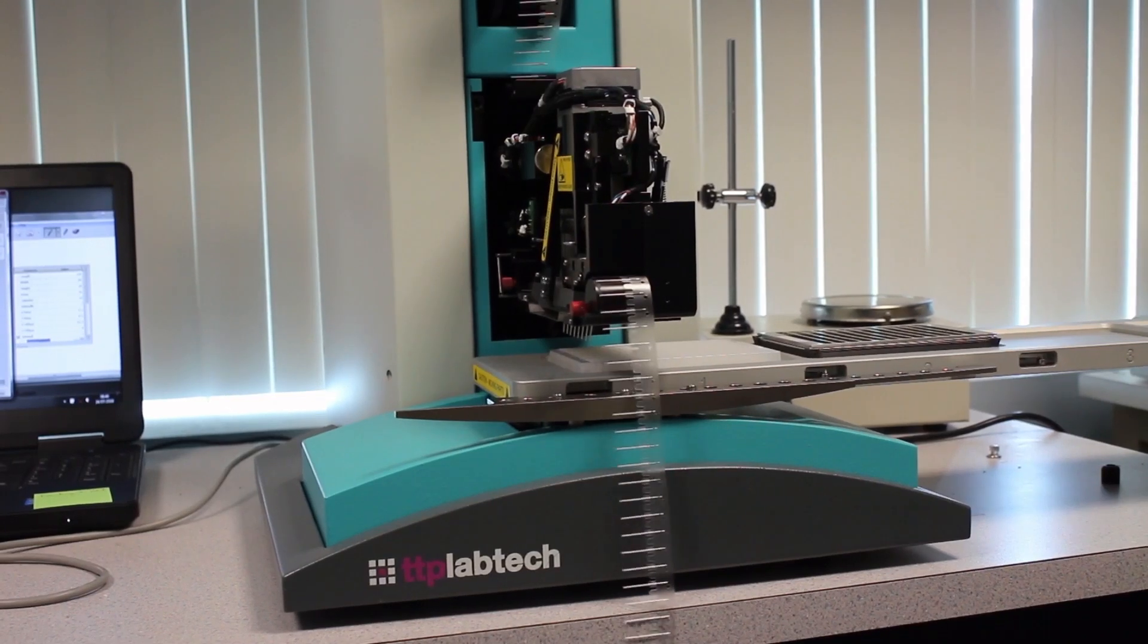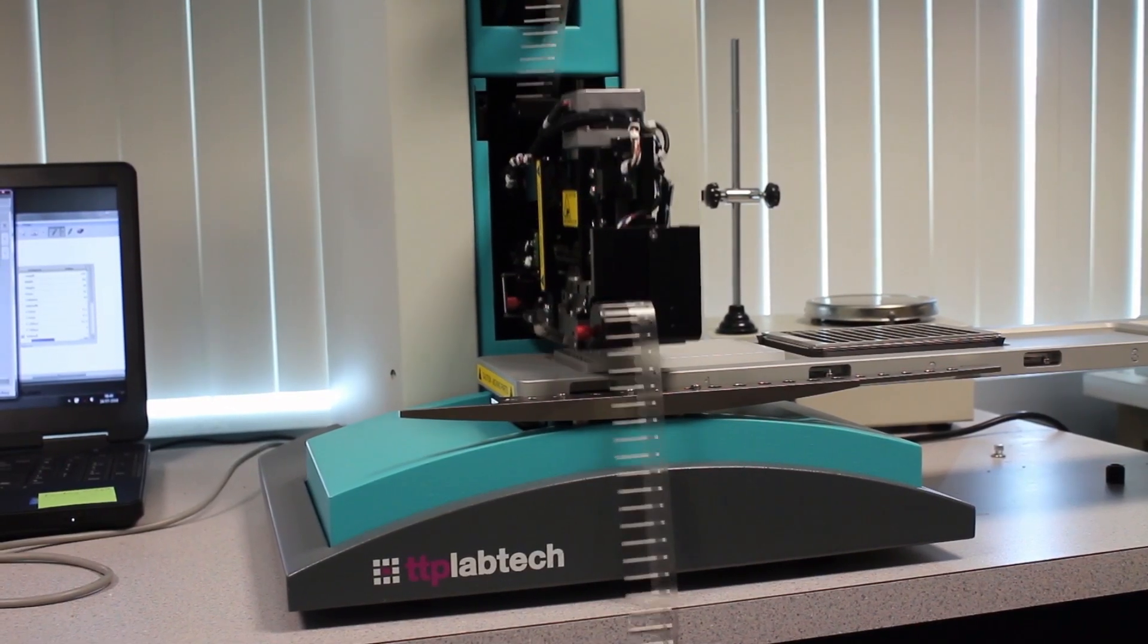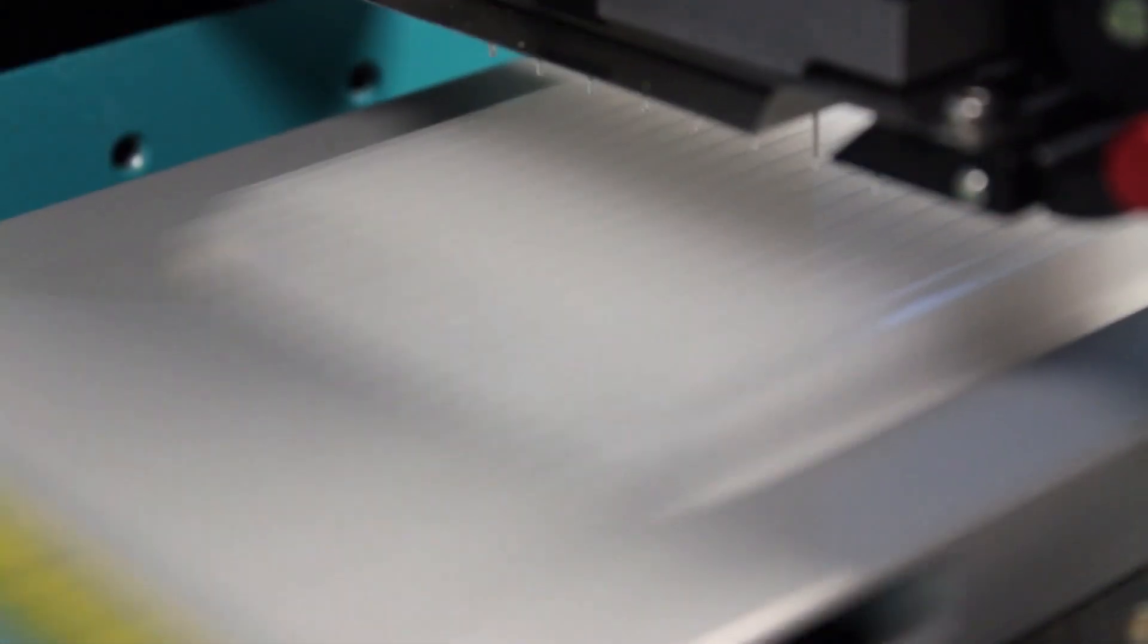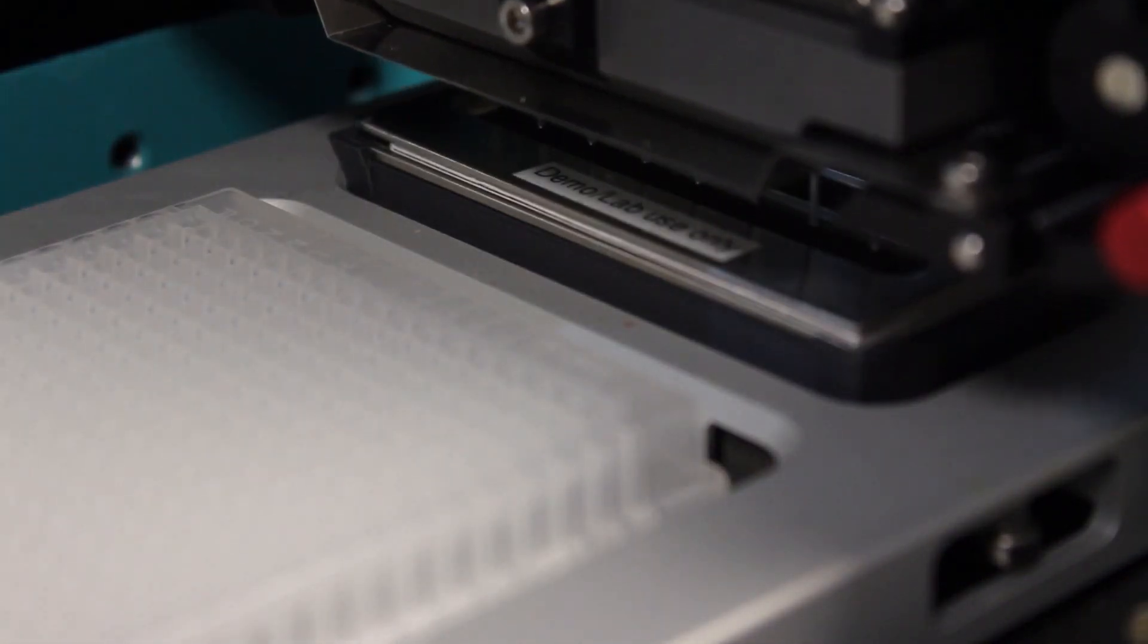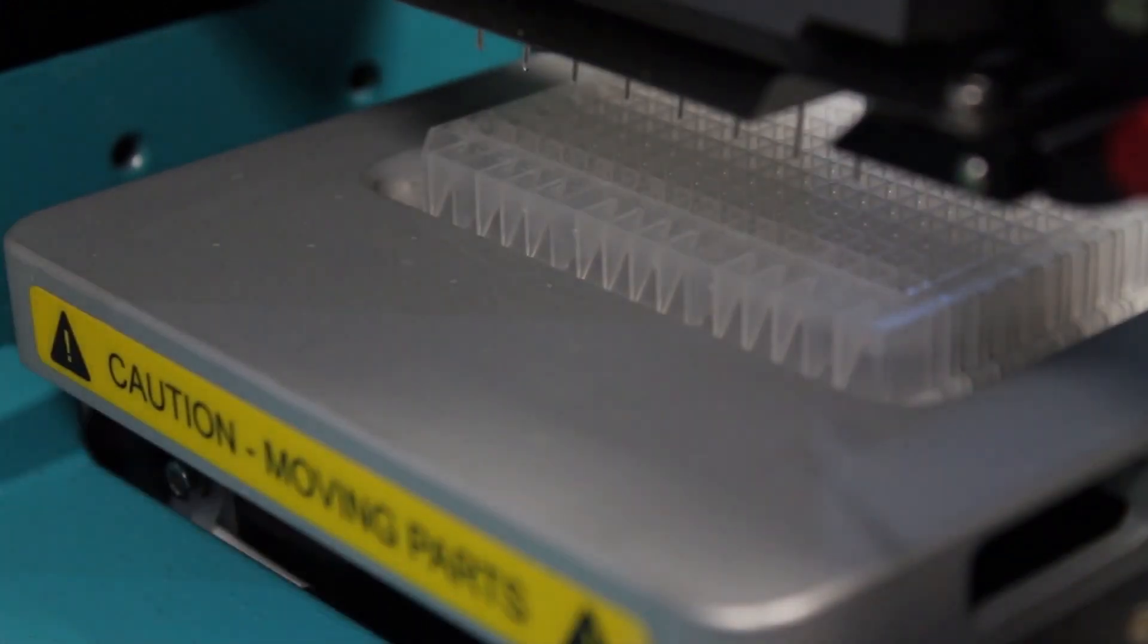Starting from either a 96 or a 384 well plate, you can use an automatic pipettor such as the SPT LabTech Mosquito to spot nanoliter amounts of sample from well plates onto our Quickstrip HT wire mesh screen.